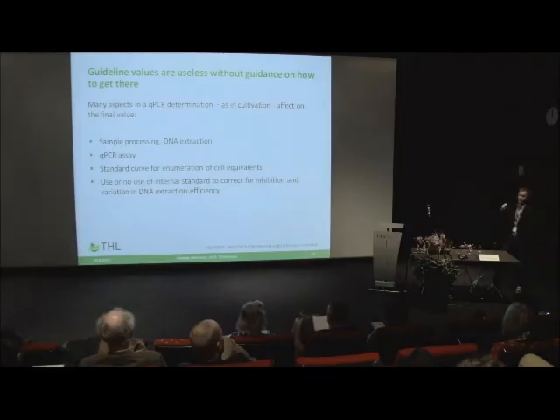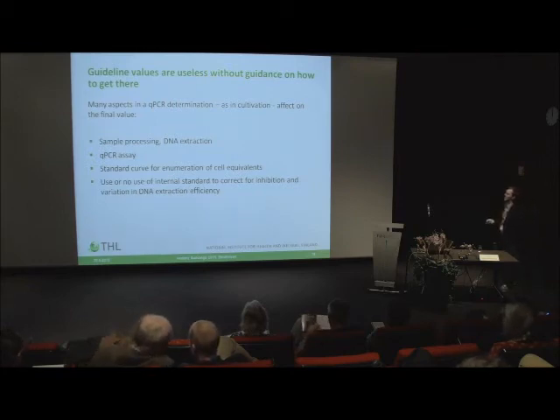And I've been talking earlier about the Penicillium aspergillus assay. If you do a standard curve, we're trying to cover this range of different species using 5 different strains, and they give you different amplification efficiency. So we try to be somewhere in the middle. But of course, you can also do it with less. I'm going to show you in the next slide how this affects the result.